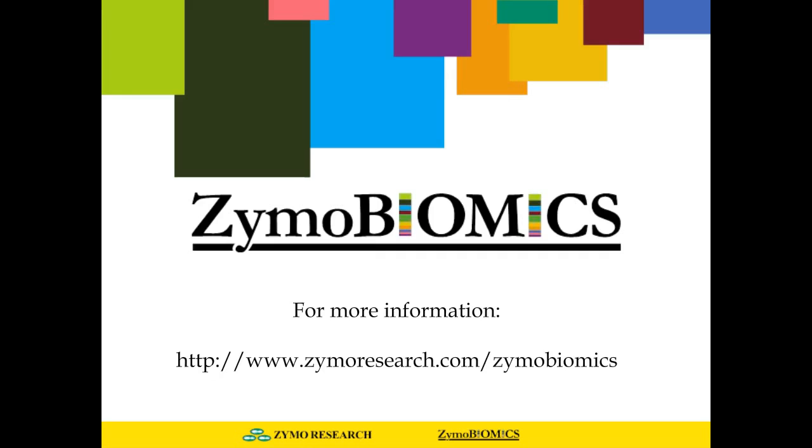Sorry, can you repeat the question again? Absolutely. How do we address microbiomic biases in tissues with low abundances of microbes? So in the case of low abundance, it's very critical to have low bioburden control for all your process. You need to have procedures to maintain low bioburden in your reagents and also during the process. As I mentioned in our ZymoBIOMICS sequencing services, all our reagents are manufactured by ourselves, so we have full control, and all the processes for DNA extraction and library preparation are done inside an ultra clean room to prevent process contamination.